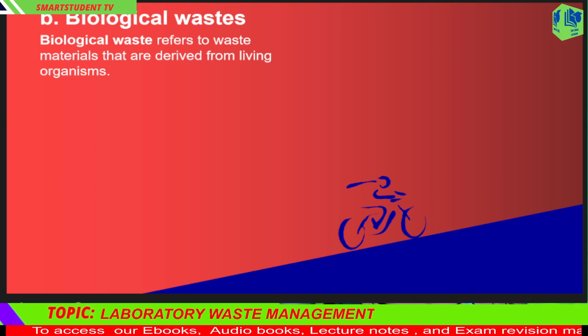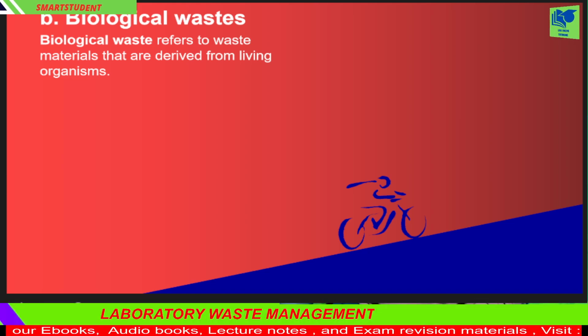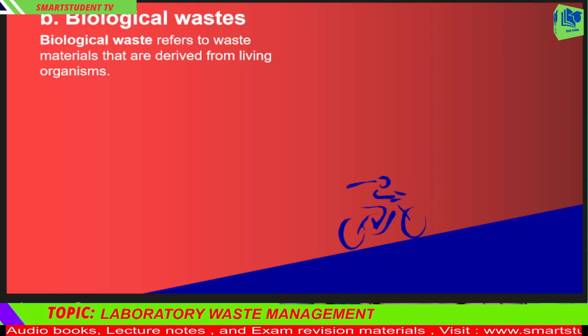2. What are biological, biomedical, and infectious waste? Biological waste refers to waste materials that are derived from living organisms. These include tissues, organs, blood, bodily fluids, and other organic materials. Biological waste can originate from hospitals, research laboratories, and veterinary clinics.